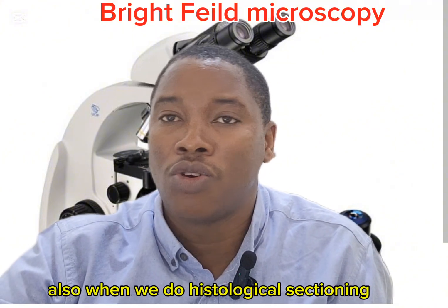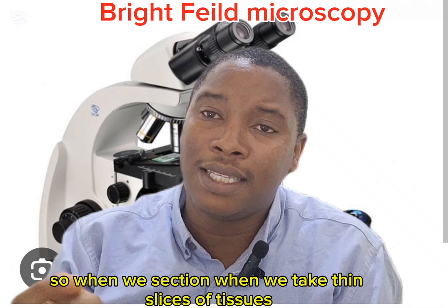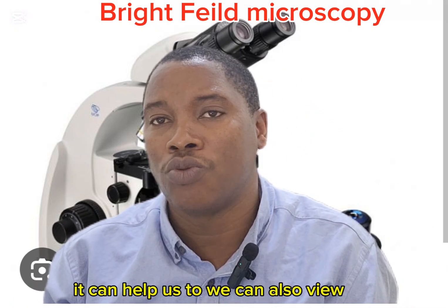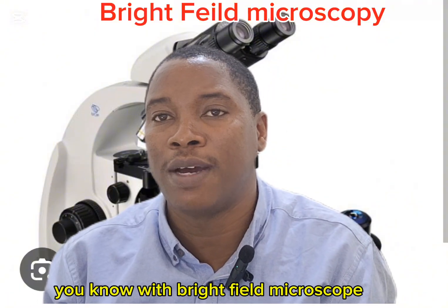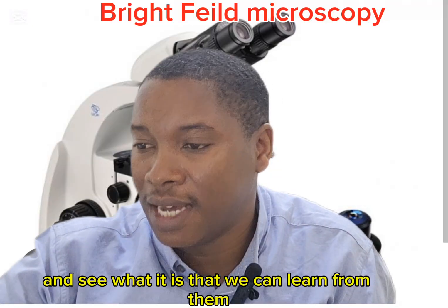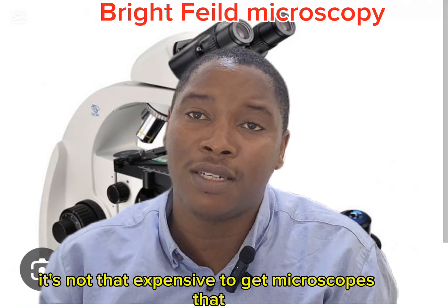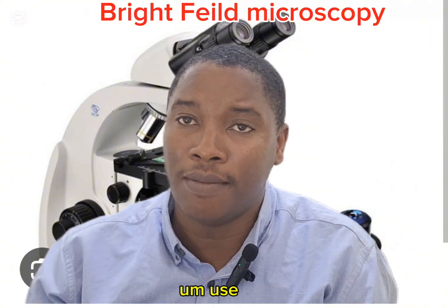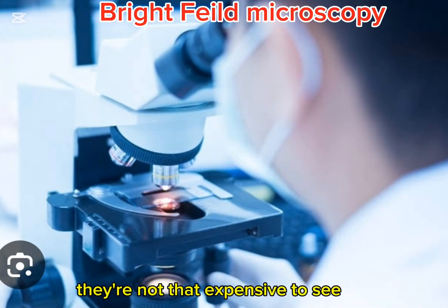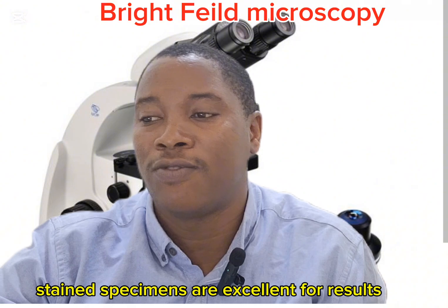Also, when we do histological sectioning, when we take thin slices of tissues and mount them in the microscope, we can also view them with bright field microscopy, and when we stain our samples, we can see what we can learn from them. So the advantages are that it is easy to operate. It's not that expensive to get microscopes that use white light, light microscopes. Also, the stained specimens are excellent for results.